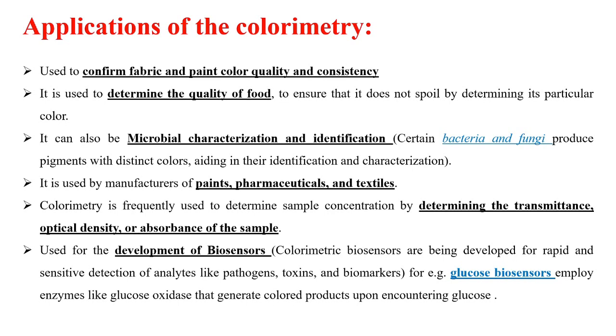Now, in the pharmaceutical industry also it is a very widely used technique to get the color. And for the development of biosensors, I think everybody has heard about biosensors. Any idea about biosensors? What can you explain? Biosensor? Yeah, like glucose measurement.